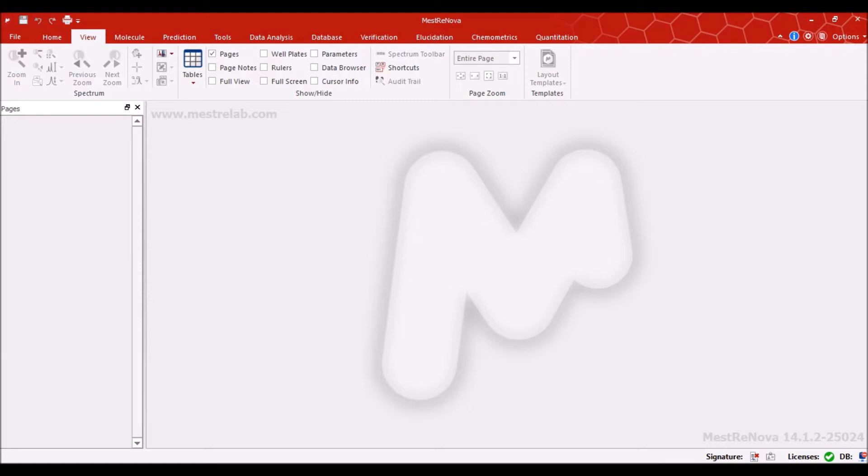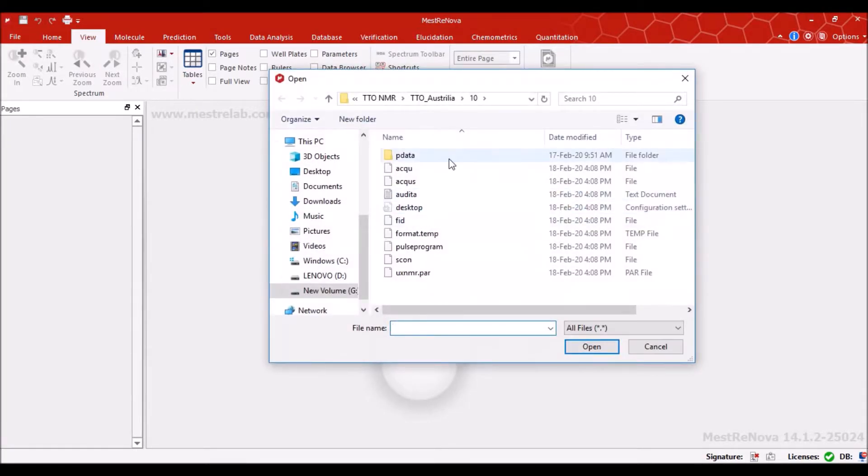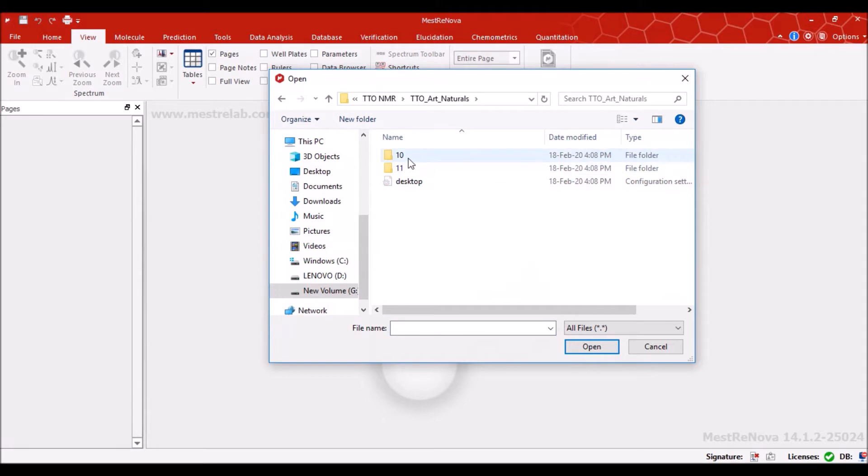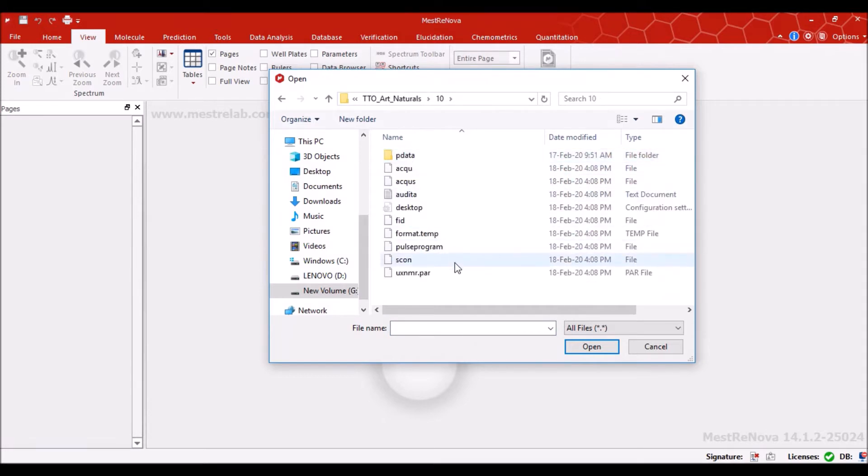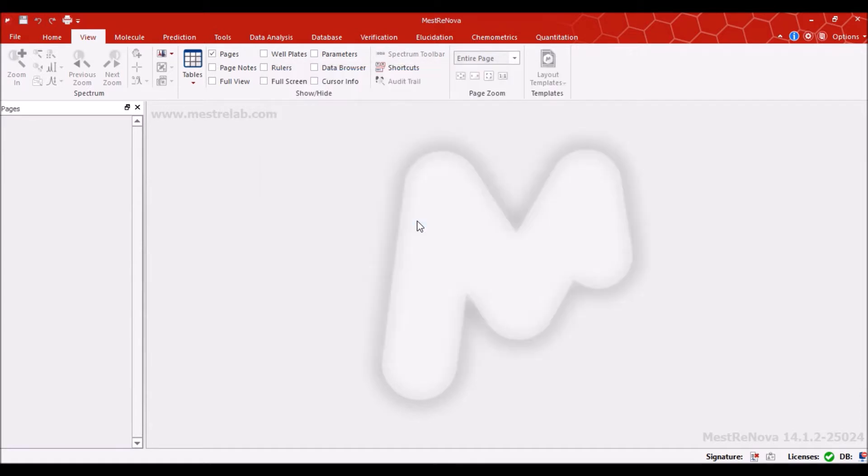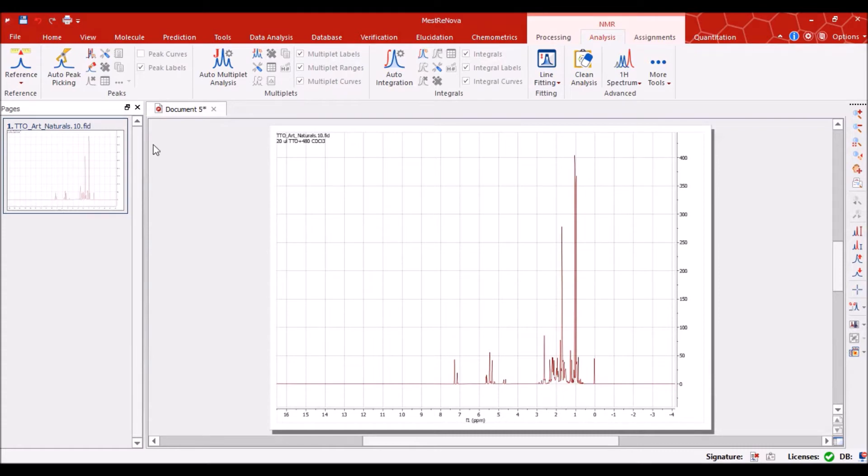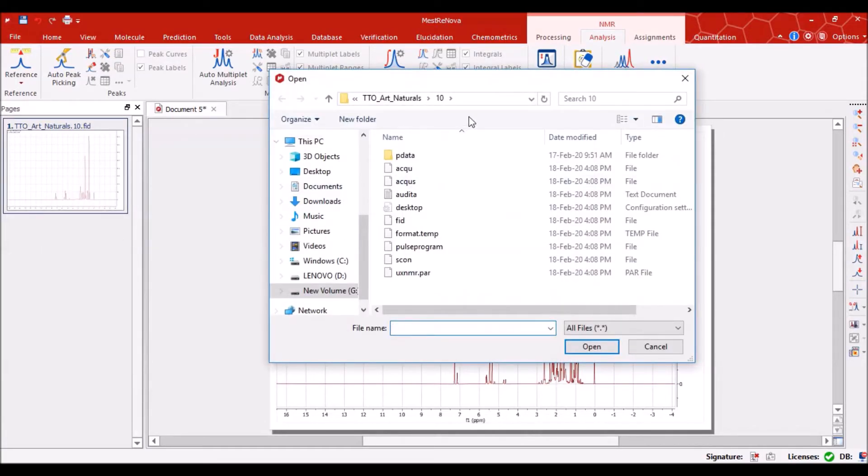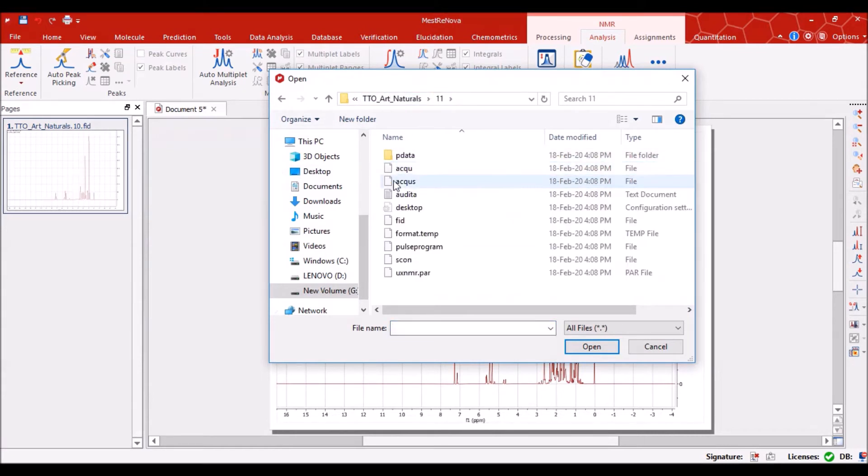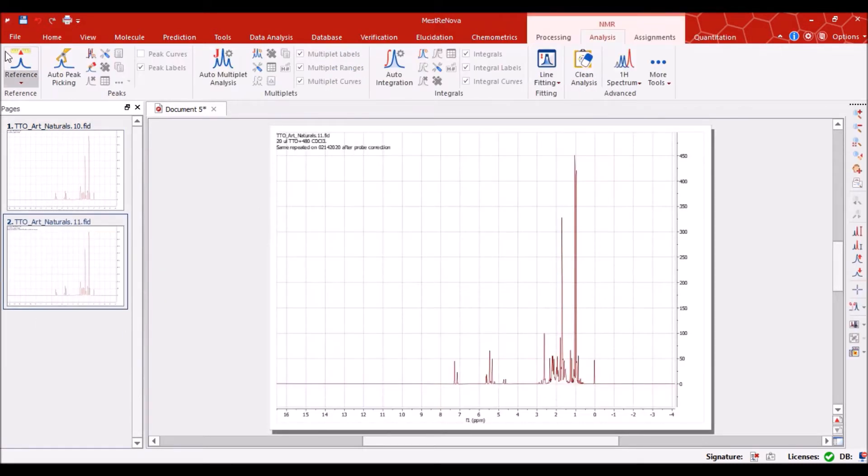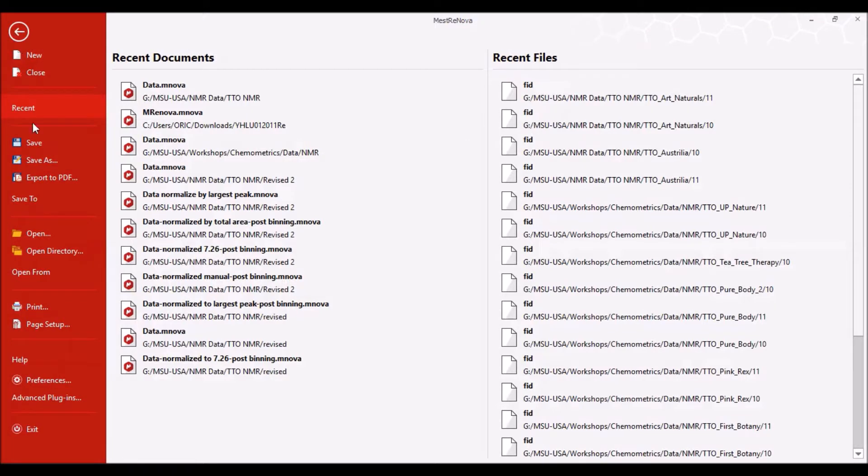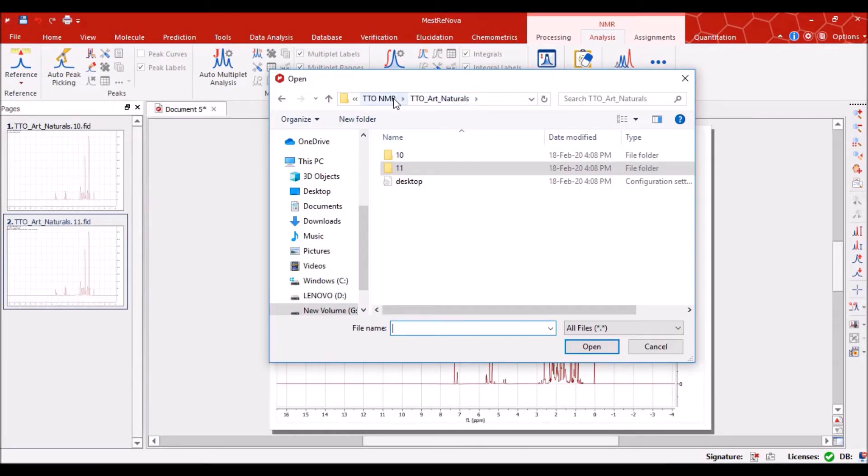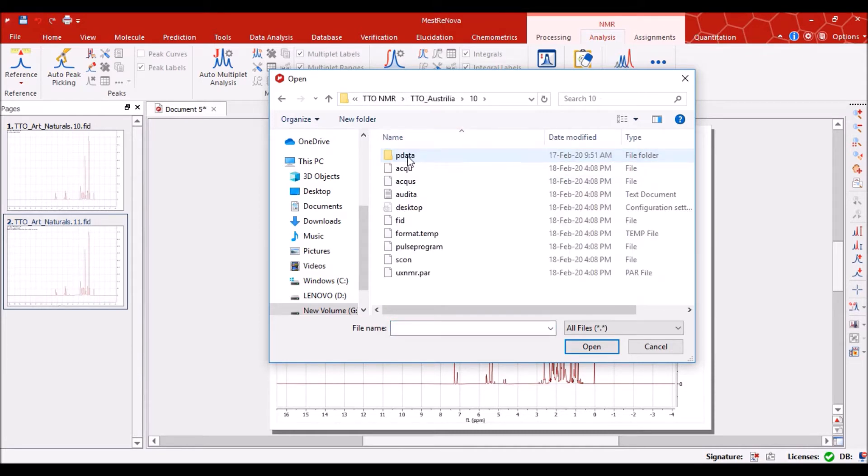So we start with opening this software the Mestre Nova and go to file and locate our spectra to open it in Mestre Nova. So the FID file of this targeted spectra is used by double clicking on it, then we go to file again to open the second spectra and FID file of the second spectra and so on. I will open few of these spectra.